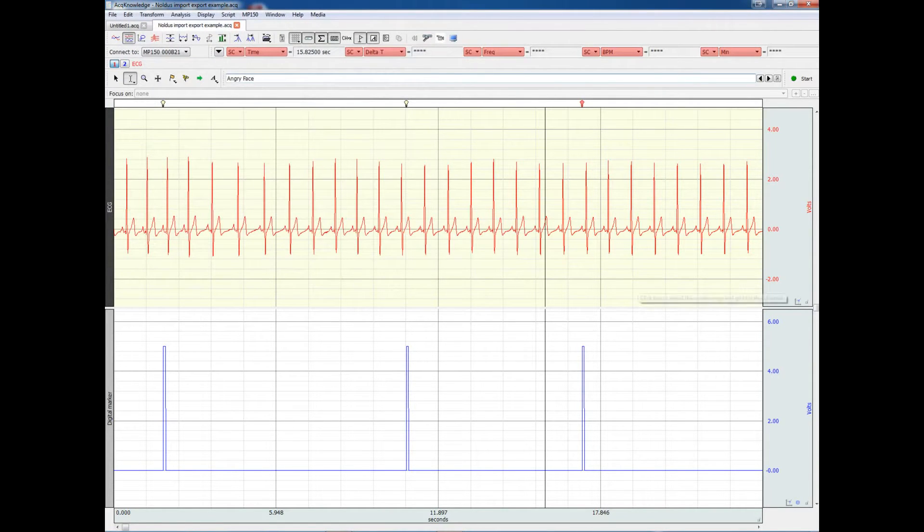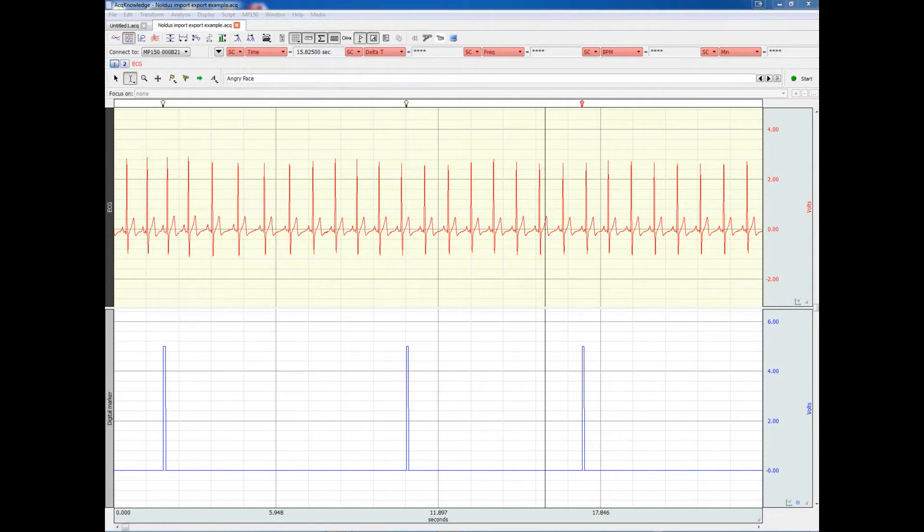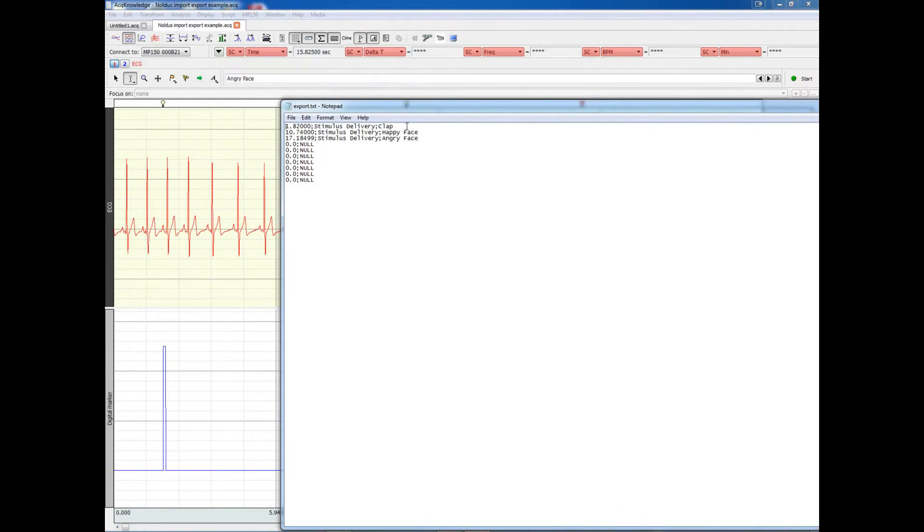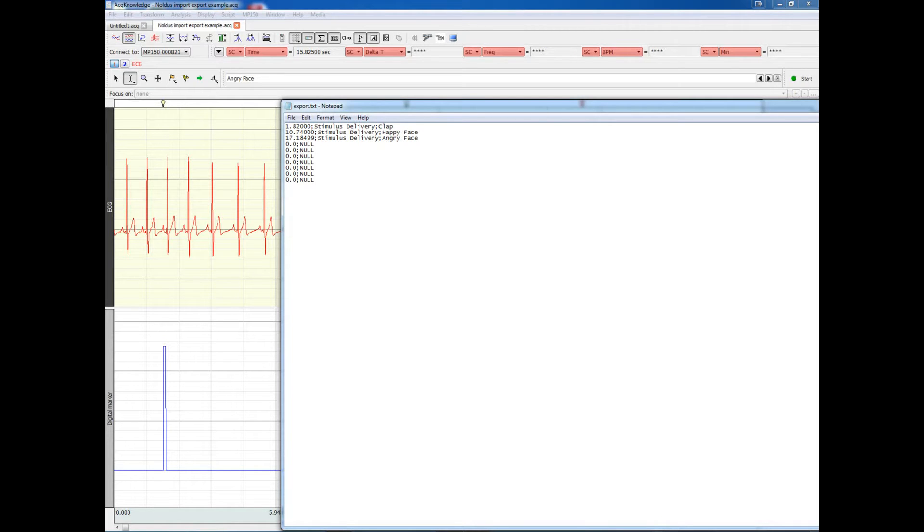And let's have a look at the result. We'll go ahead and open up the export file. And this is how it looks. We have stimulus delivery events, three of them, and the labels are given, as well as the time of the event.